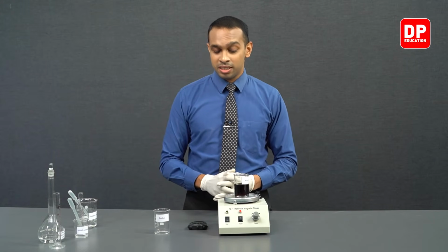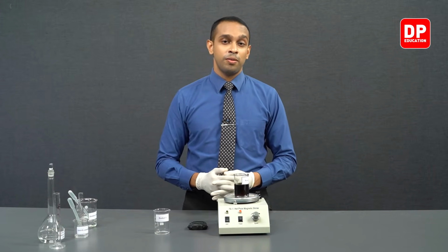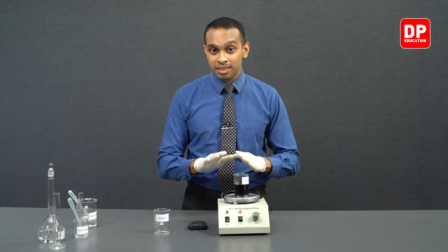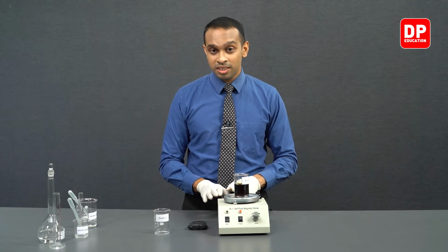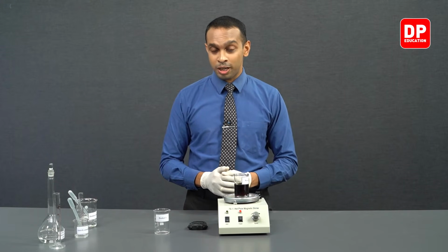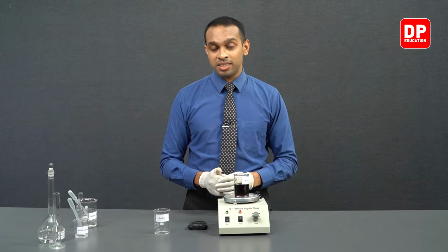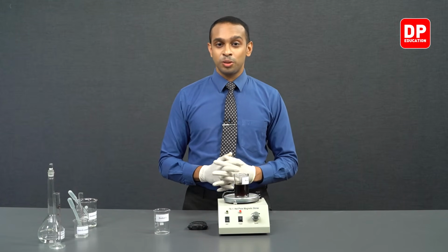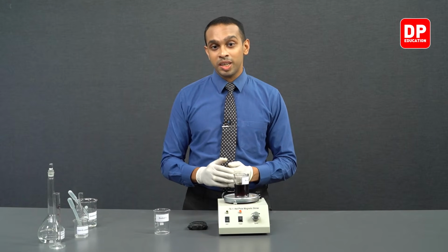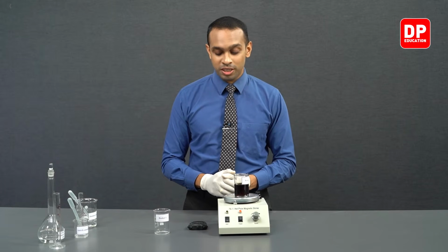Now since in this particular reaction it took longer for us to observe the color change, it is very clear that as we decrease the iodide ion concentration, the rate of the reaction slows down, right? So the time taken for the color change to happen will increase as we decrease the iodide ion concentration.